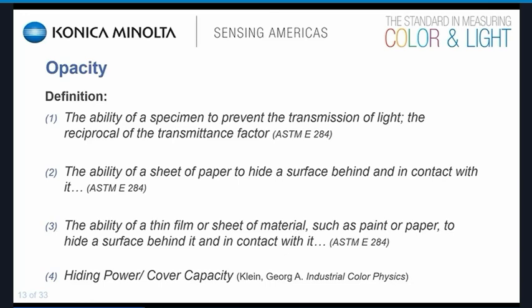But ASTM has three definitions, and what's important to note is those definitions determine how you're going to measure opacity. So when you need to measure opacity, you need to put in your standard operating procedure which way you're going to measure opacity. So you need to define several things.